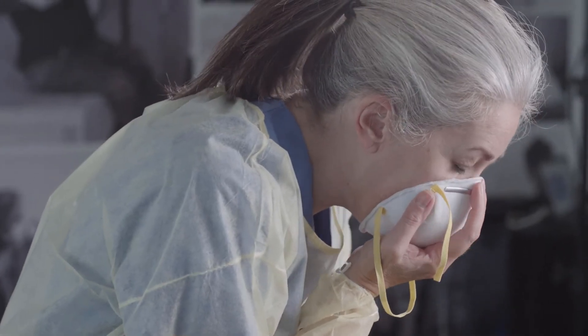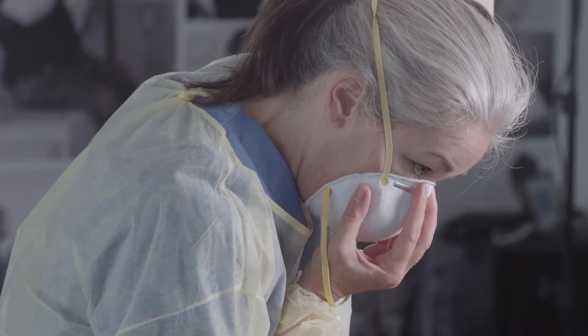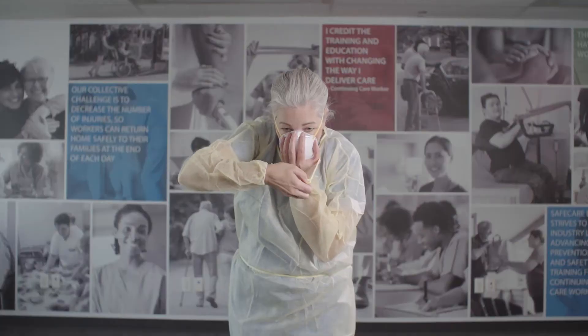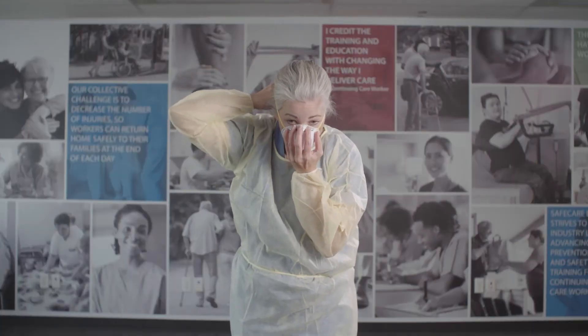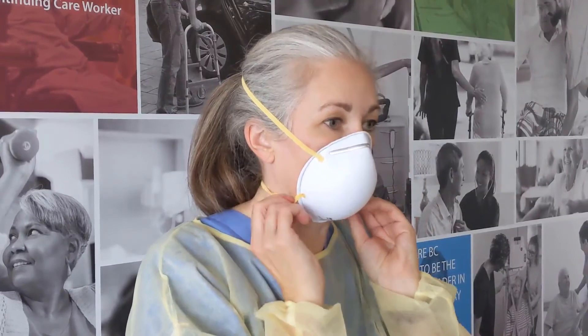Cover your nose and chin with the mask. Pull the top strap over your head and place it at the top back of your head. Then pull the bottom strap over your head and place it at the base of your neck. Press the nose band down to form it to your nose. Perform a seal check: using your hands, cover the surface of the respirator and gently exhale. Take a quick, deep breath in, checking that the face piece collapses slightly. If air escapes through the edges, readjust the fit of your respirator and perform another seal check.